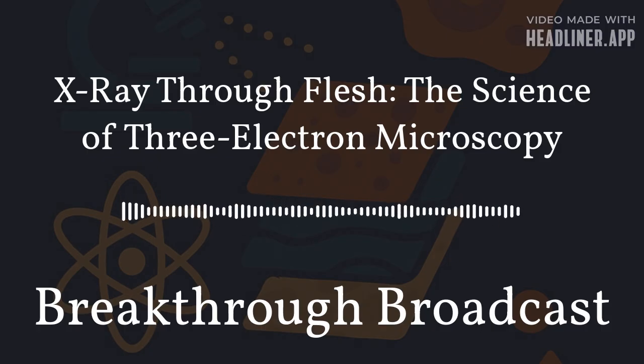Backscattered electrons reflect something different. These are high-energy electrons from the original beam that bounce back after interacting with the atomic nuclei in the sample. The likelihood of backscattering depends on the density of the atom hit. Heavier atoms reflect more electrons. This allows a computer to produce an image that shows contrast based on density and composition inside the sample. Regions rich in heavier elements appear brighter, while lighter regions appear darker. In biological tissue, this contrast often corresponds to variations in protein concentration, mineralization, or just structural density.